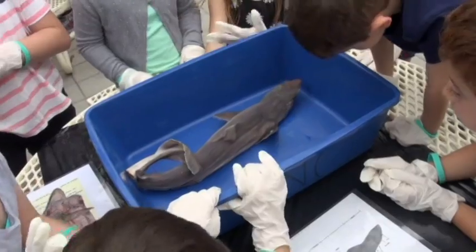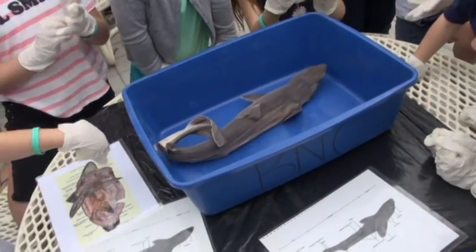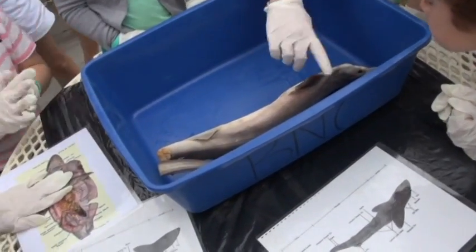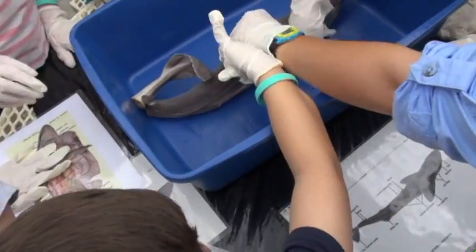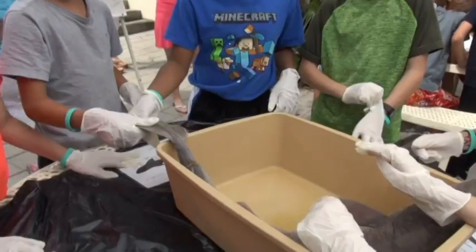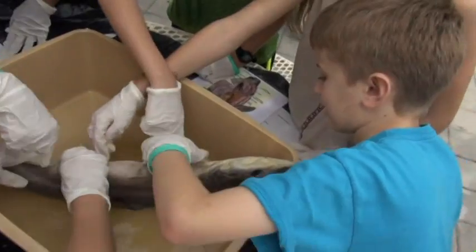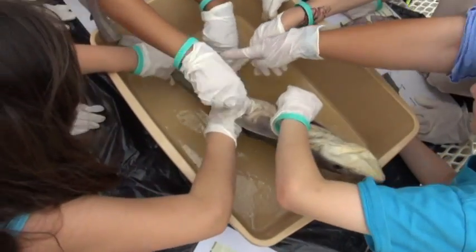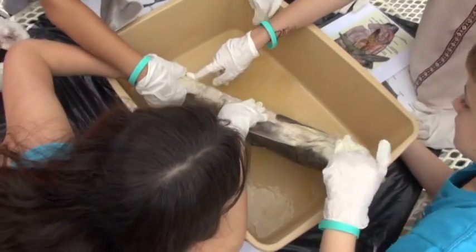Joel, don't touch your shark. Actually, we'll need them so they can sit at the bottom and not disturb them. You see that dorsal fin, that top fin? Find me that top fin. It's called the dorsal fin. Yep. You guys can go ahead and lift it up. Okay. Find me the pectoral fin. Find your shark. Pelvic. Oh, it's right there. Pectorals, pelvic right there.